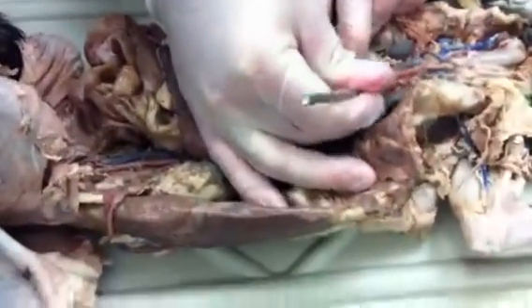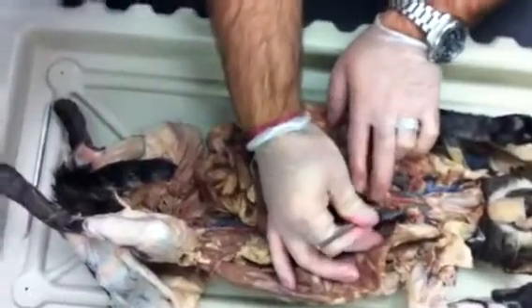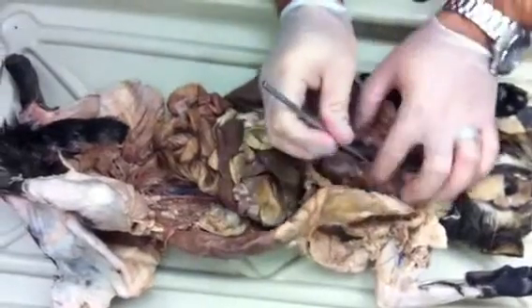Out of the heart, the artery is called the aorta, right? So it makes a little circular loop called the aortic arch, the very top of the heart. Sometimes it's hard to see, but the pericardial sac kind of drifts up and covers it, but it's right there on the very top of the heart. That's the aorta. Aortic arch, aorta is fine.